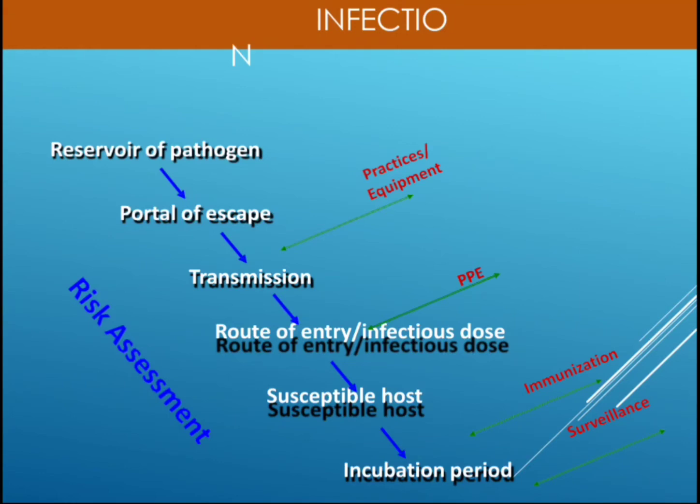So infection, how it is being carried out: reservoir of the pathogen, then portal of escape, then it is transmitted, route of entry, infectious dose, then susceptible host and the incubation period. So what are the risk assessments? Risk assessment are the practices and the equipment.